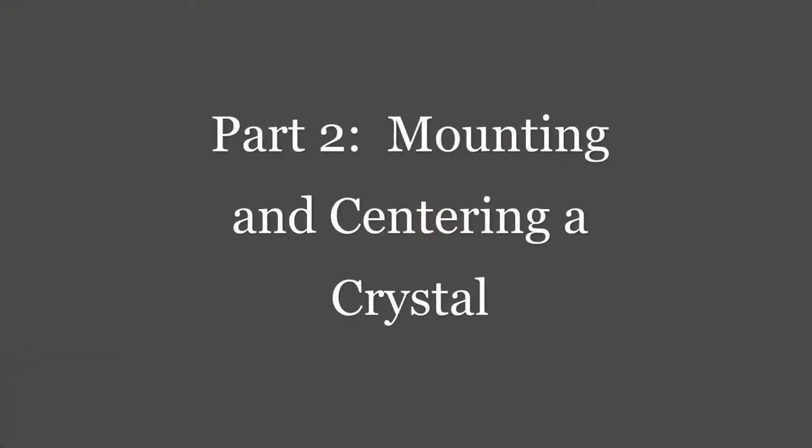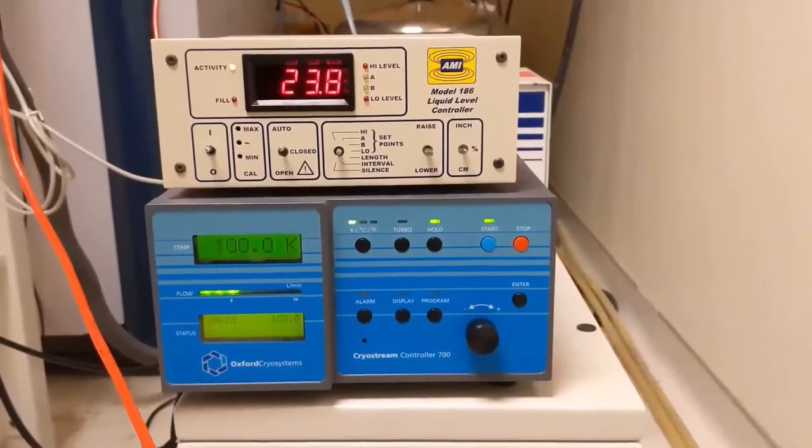In this video, we will discuss mounting and centering a crystal. Before picking up a crystal to mount on the instrument, check that the cryostream is stabilized at 100K.